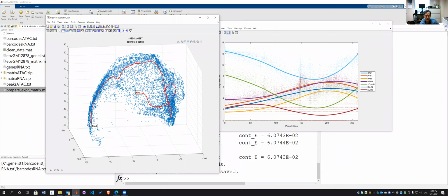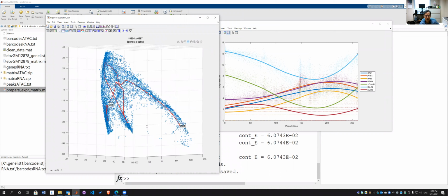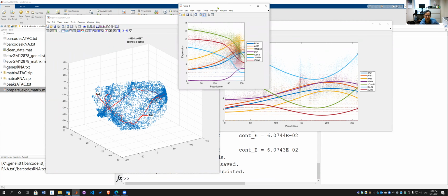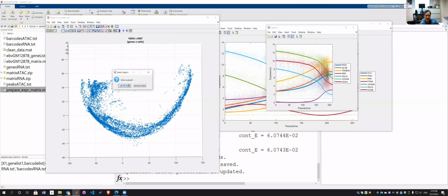So from seeing this trajectory, I think this analysis is over complicated, and we probably don't need such a close model of trajectory. So I will change back to spline fit. I really should clean up the data first, then select this spline fit.